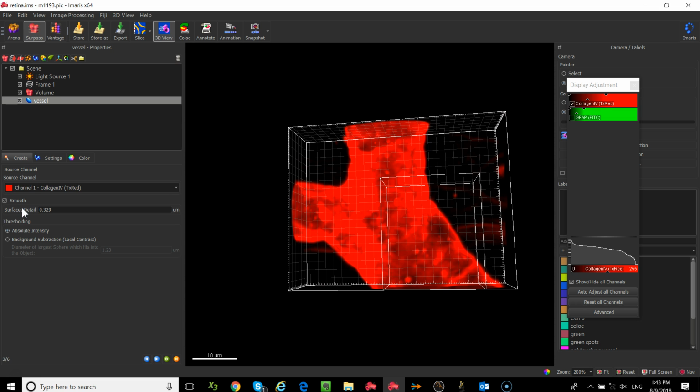So the very edge of your structures is a jagged edge of these boxes, effectively. If you apply no smoothing, the surface will be very rough. It takes more triangles to represent that. It takes more time, and it also doesn't look very good. So a smoothing filter is applied by default to make the edges look smoother.